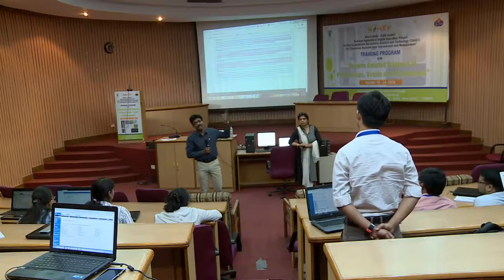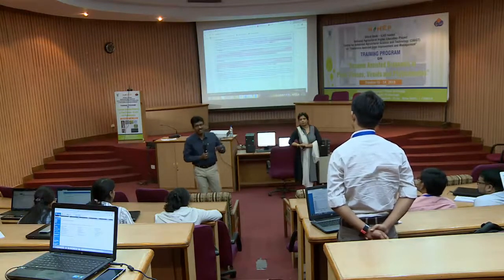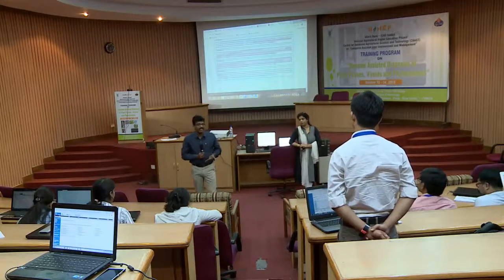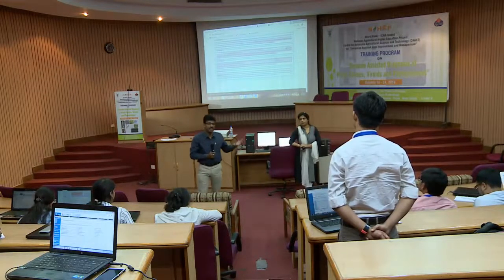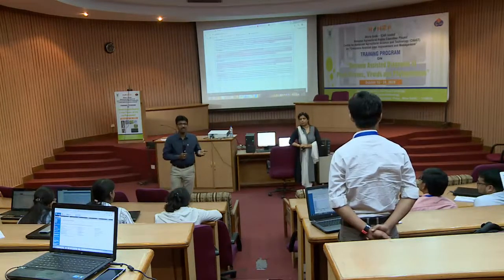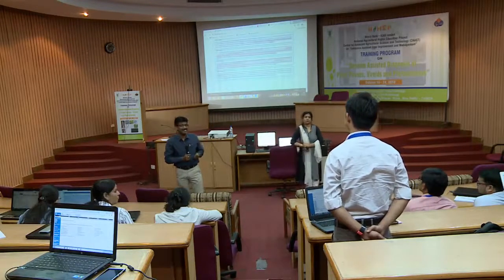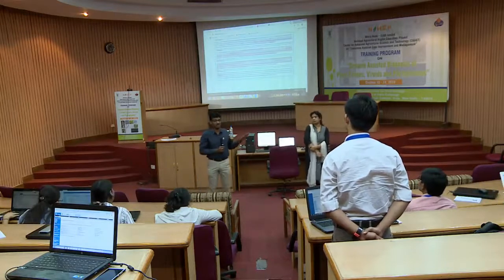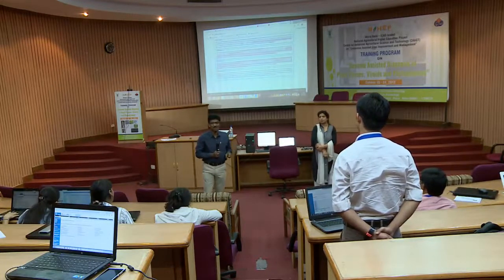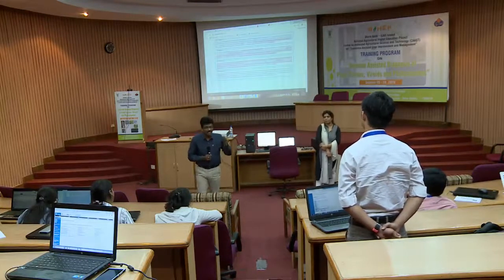And the curator will spend time on the chromatographic file. If you are telling him that you have a gene sequence that is a different allele compared to the one already there, you are claiming a new allele, then your claim is verified by the curator of those databases, and only then is he going to accept it, right? If a 100% match is there, then no problems, no complaints. If you are claiming novelty, then the problem comes, right? And how authentic is your data, whether it is a base call or a sequence error.